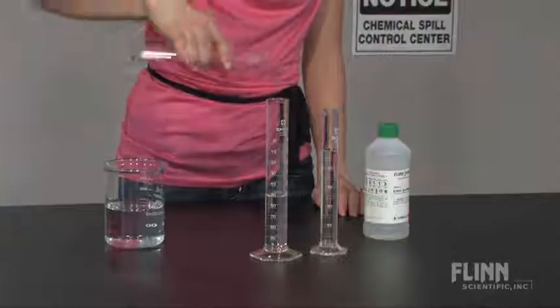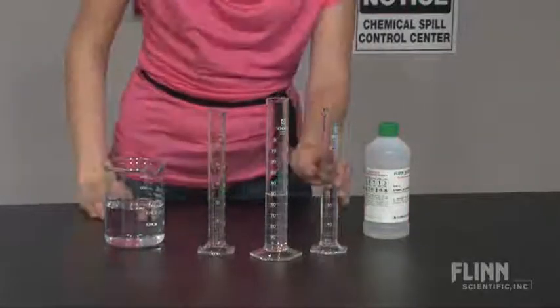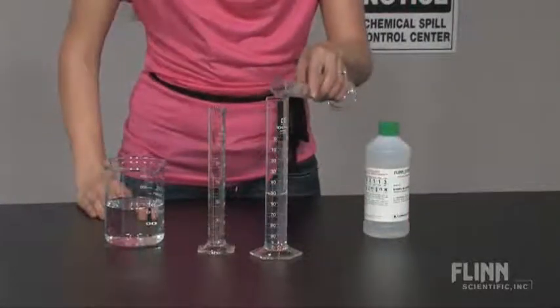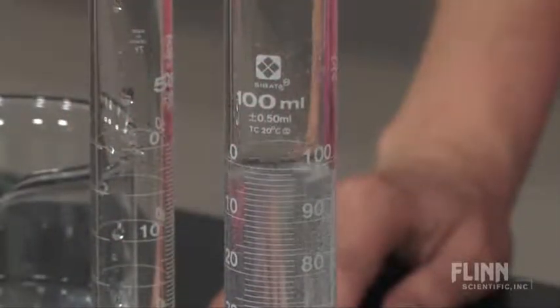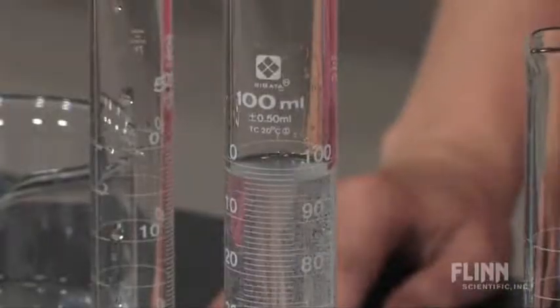When 50 milliliters of water is combined with 50 milliliters of ethanol, the overall volume produced is less than 100 milliliters. This is because ethanol molecules pack closely with water molecules due to hydrogen bonding.